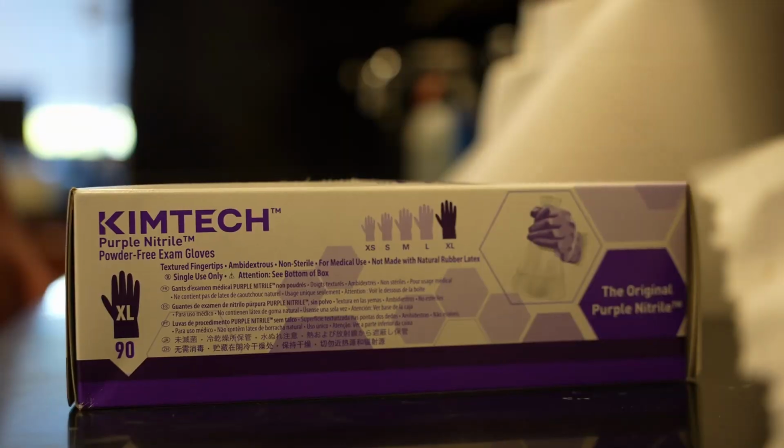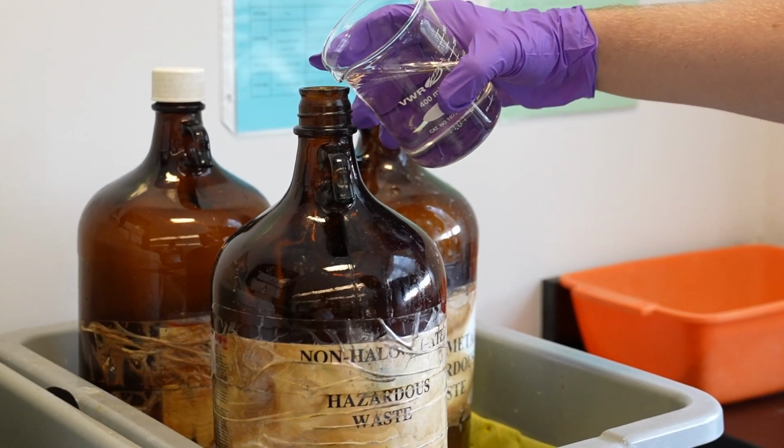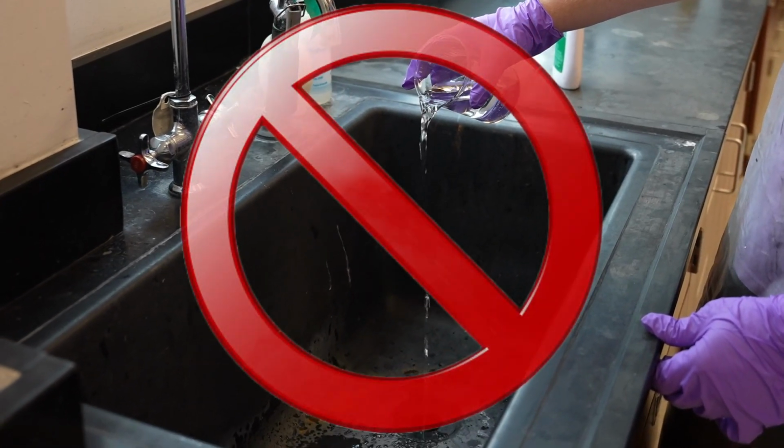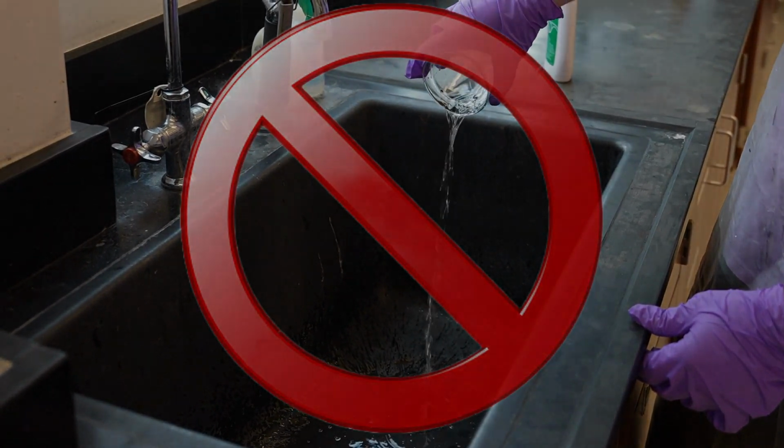As per usual within any lab experiment, wear safety goggles as well as gloves, and exercise normal safety procedures. All waste will be disposed of in the non-halogenated waste container. Don't drain anything that you'll be using down the sink unless your TA approves so. With that out the way, let's start on Part 1.